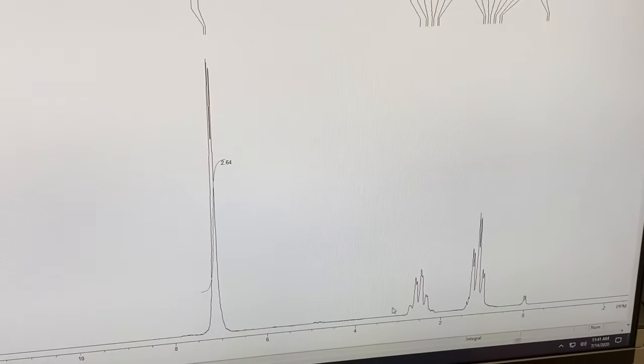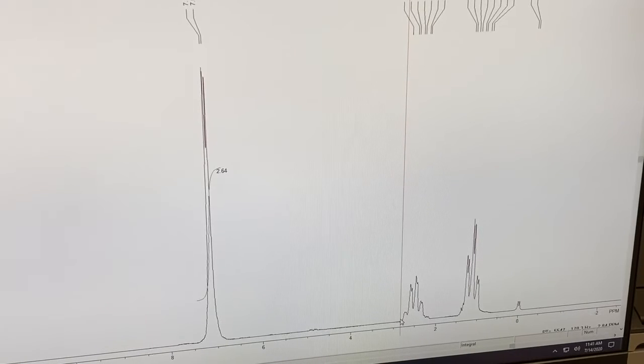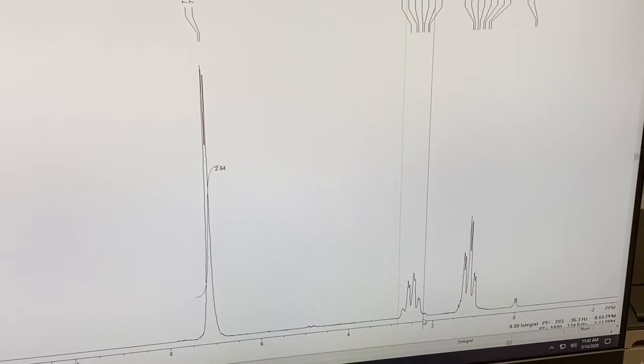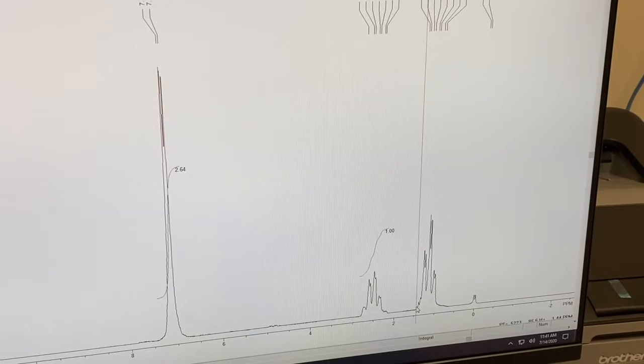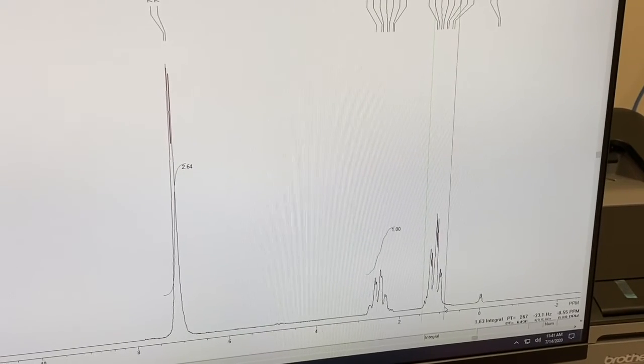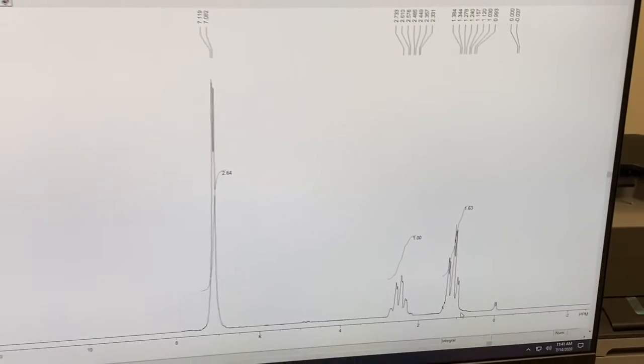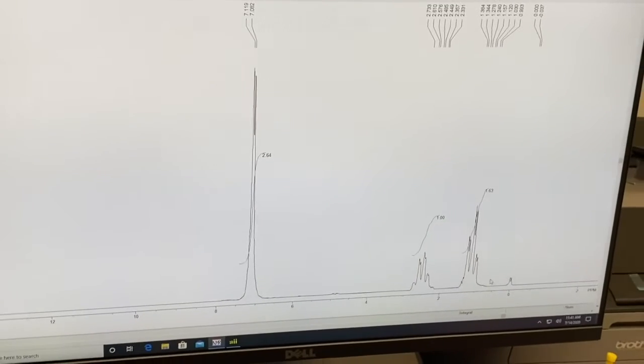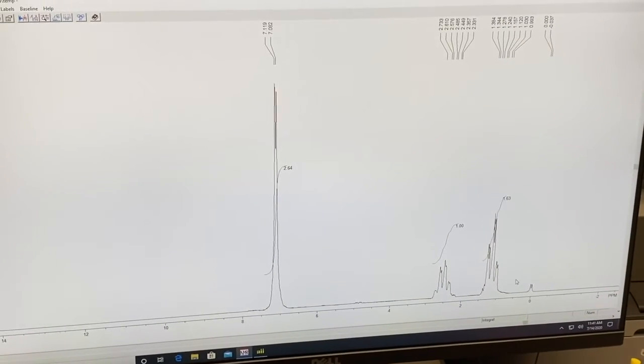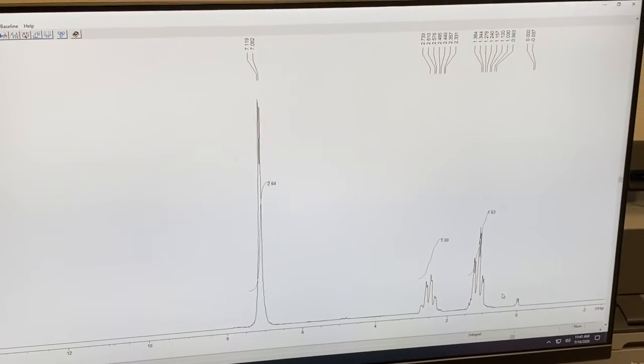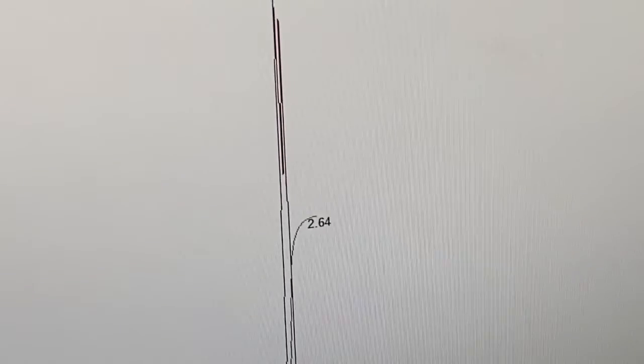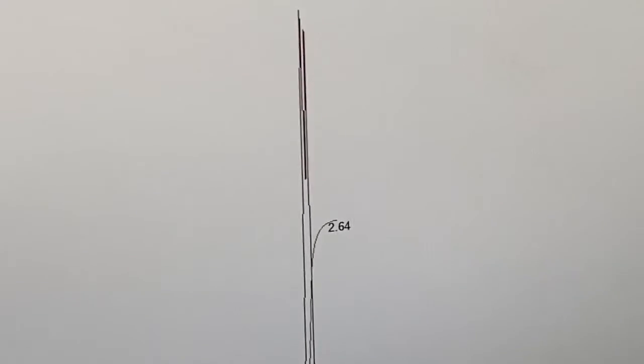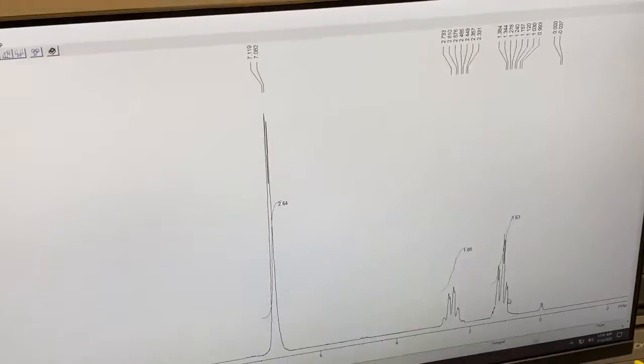Go to the next one, click one time to get the cursor, click one side, and then the other. And then do it for your third peak. One side, and then the other. So now we've sectioned off all the peaks. And if the computer were to miss one, this is how you would get it back. There are numbers assigned to the peaks, but a lot of times they don't make any sense initially. And so you're going to want to actually make them some whole numbers.